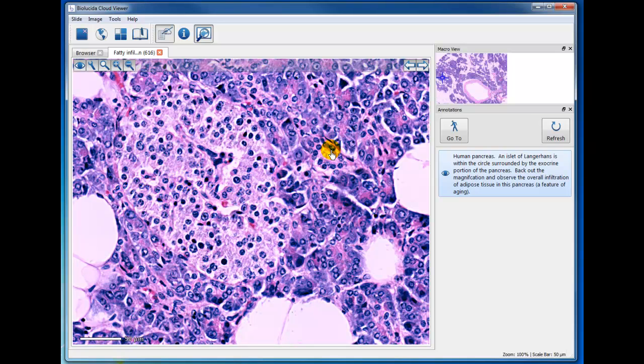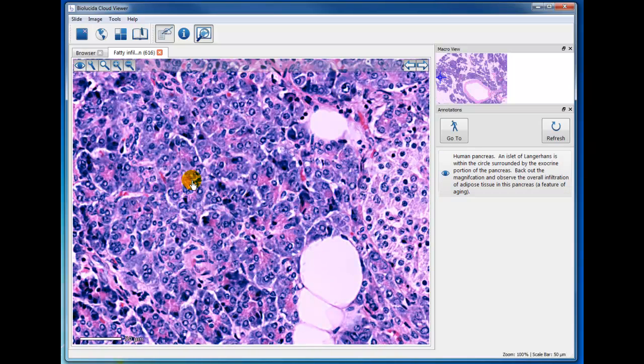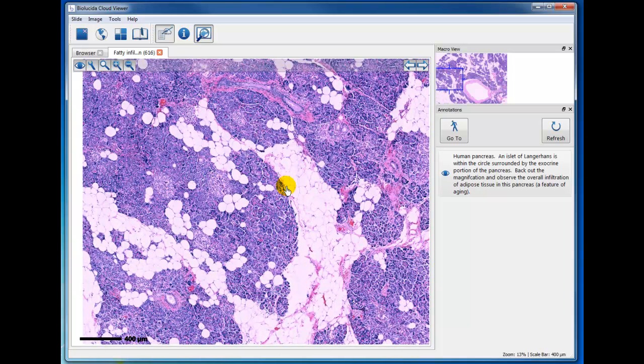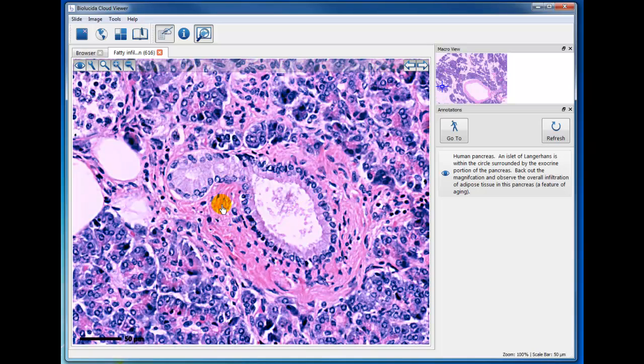But out here are the exocrine portion of the pancreas. These are the acinar cells. In the middle of an acinus is the beginning of the duct, the central acinar cells. So let's now go over to, well, I guess one more thing. Hopefully you recognize this is dense connective tissue that is forming a cuff around one of the ducts. This is a smaller duct joining a larger duct. And of course the very tiny ducts are the intercalated ducts.